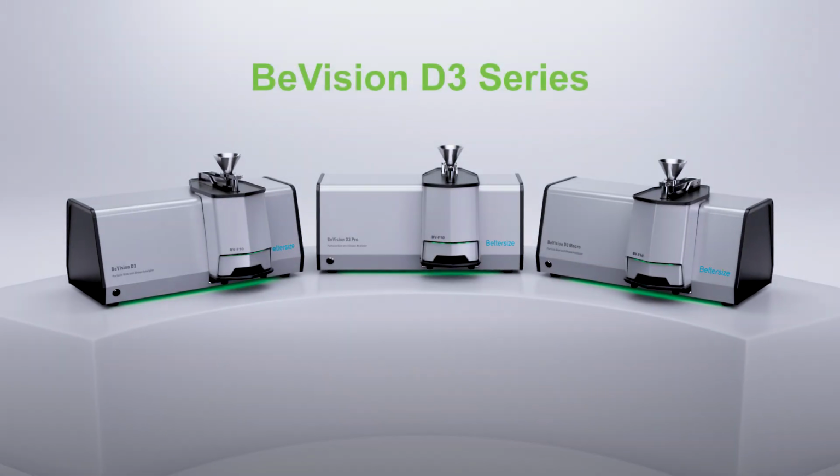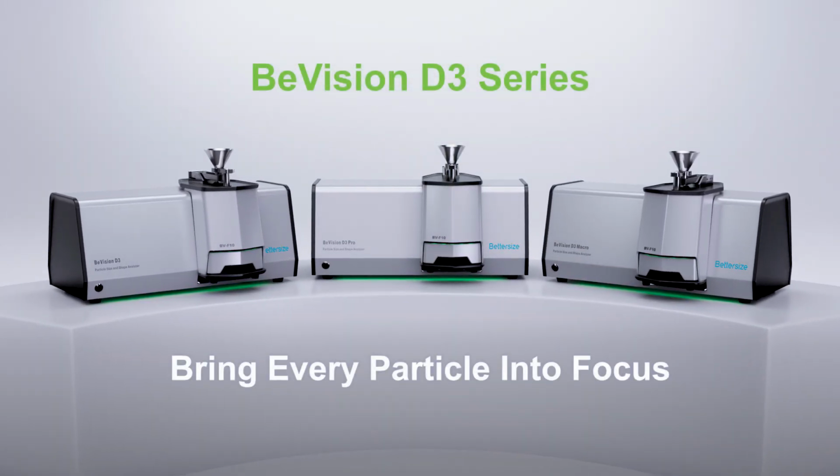BeVision D3 Series. Bring every particle into focus.